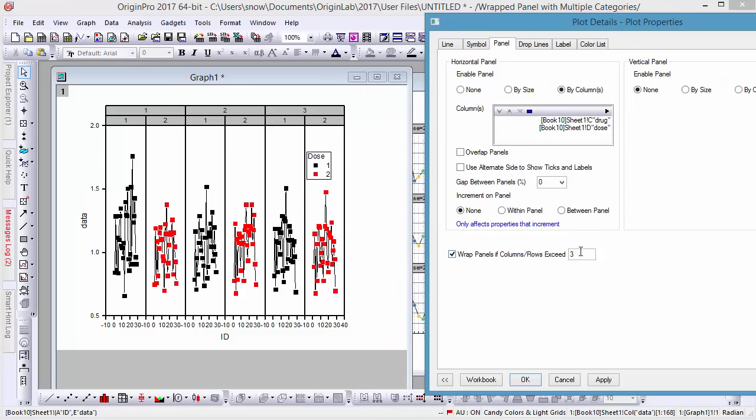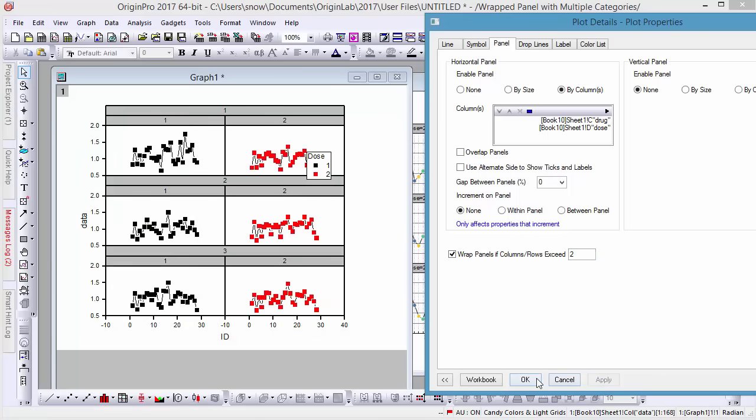Trellis plots can easily be reorganized from the plot details dialog by using the Rat Panels setting. Here we've set Rat Panels to 2, so that each drug is listed in its own row.